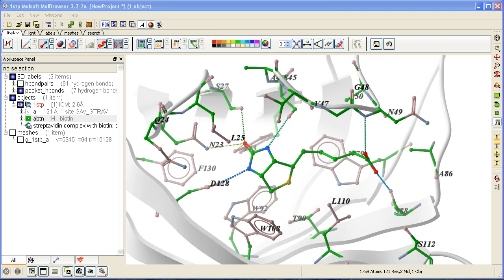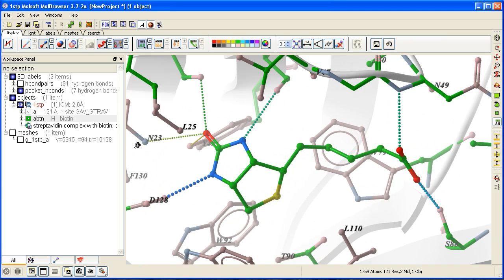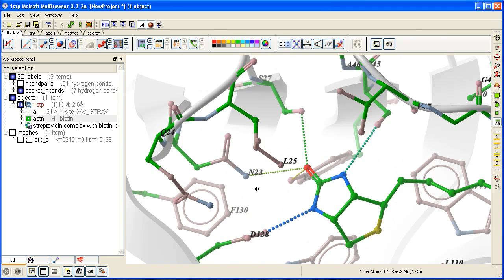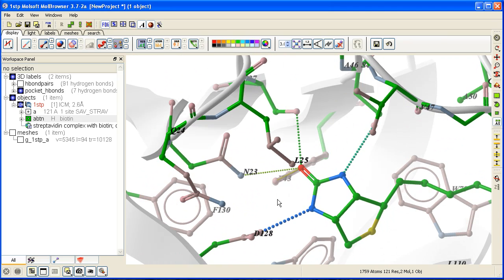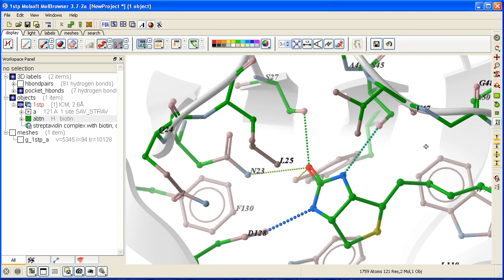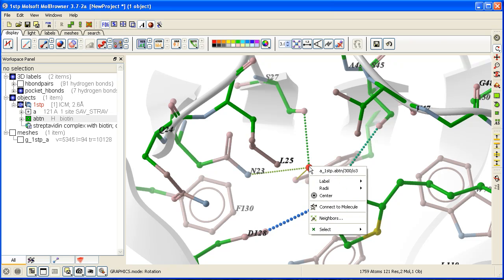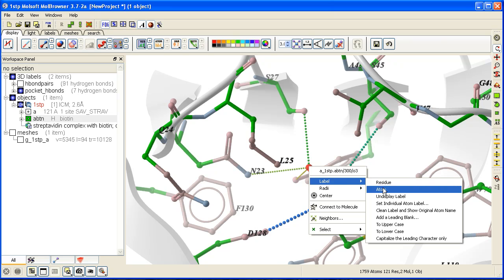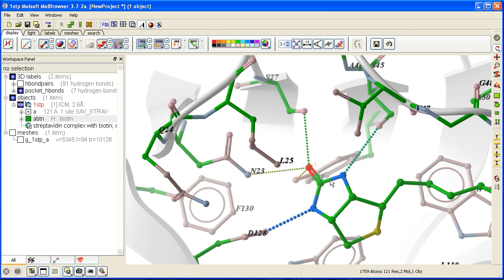How to label atoms. One way is to zoom into the atom that you want to label. Make sure you are in rotation mode, then right-click on the atom and select 'label atom'.